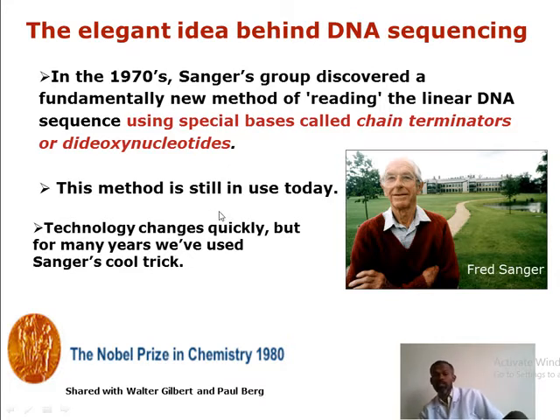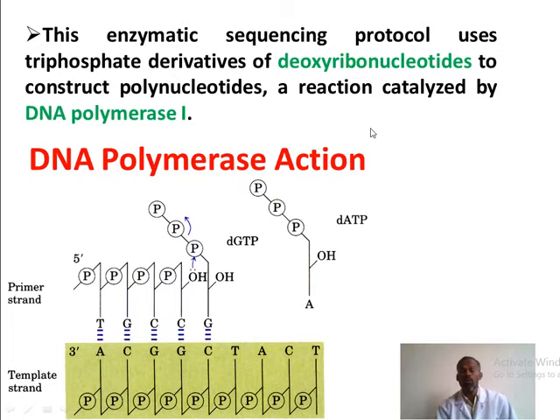Actually this technology is still in use, because this is the base. From this there are many advances nowadays. Okay, technology changes quickly, but for many years we have used Sanger's cool trick, and he got the Nobel Prize in 1980, shared with Walter Gilbert and Berg. Okay, so here is how he discovered this method and how we can proceed.